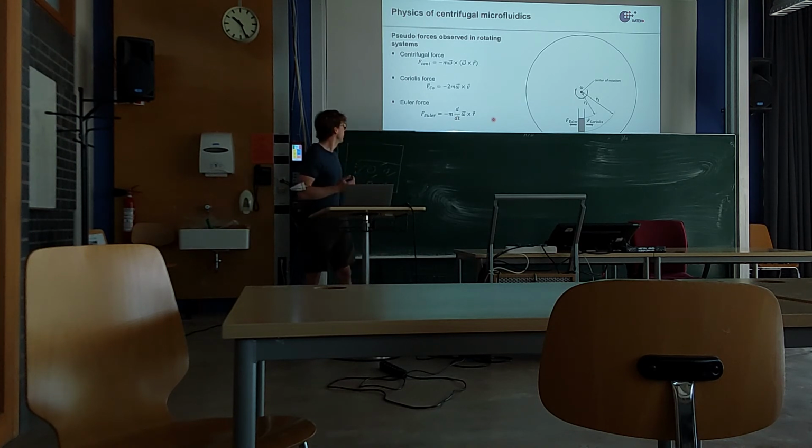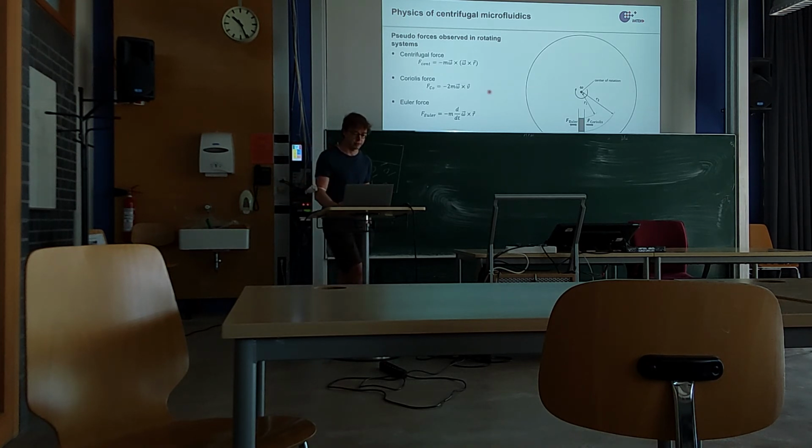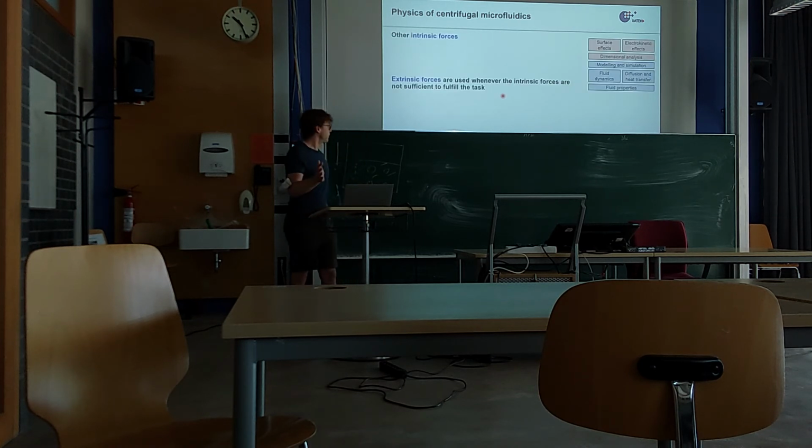And we will have a look at what happens with liquids when you make use of this Euler force in the unit operations section later on.